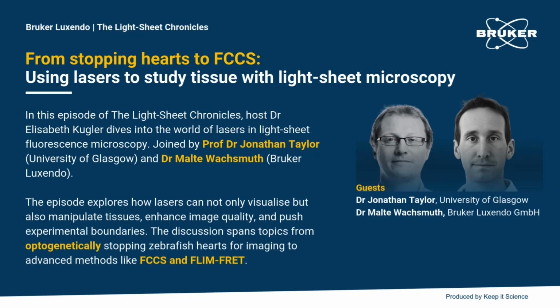So the correlation functions are calculated automatically with GPU accelerated algorithms, and the fitting is not necessarily traditional curve fitting anymore, but they use a lot of machine learning, and it's quite amazing how well this works when you compare it to ground truths based on fitting of data. So this has gotten significantly more robust than what we know from 10, 15 years ago. And I think this really turns it into a tool that is actually usable also outside a niche of biophysicists who know a lot about mathematics.